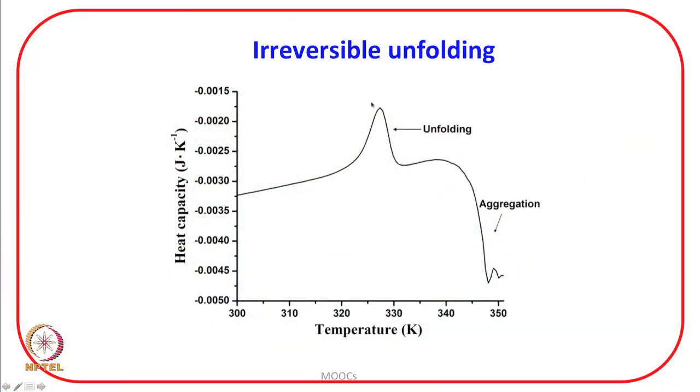If after the thermal transition there is a strong exotherm observed, and if I am calling upwards the endotherm, then downwards will be exotherm. This exotherm can begin here also, that is, as soon as the transition is over, or it can begin a little later corresponding to the temperature where the event begins.